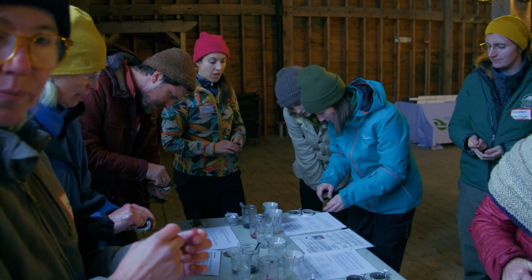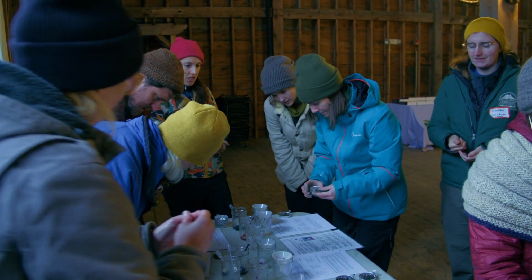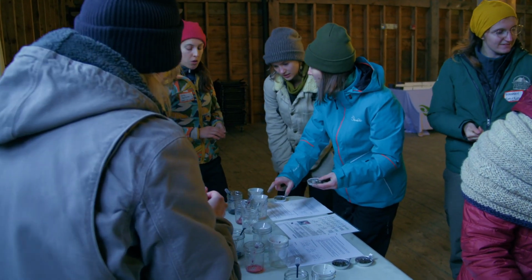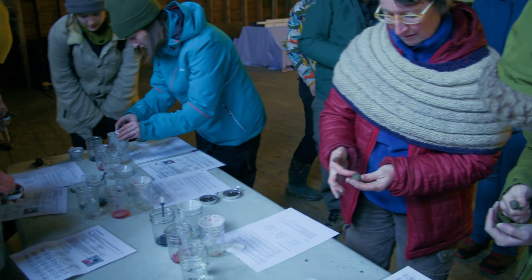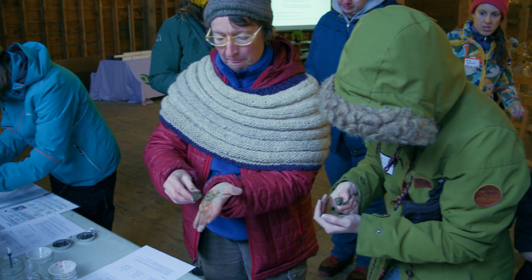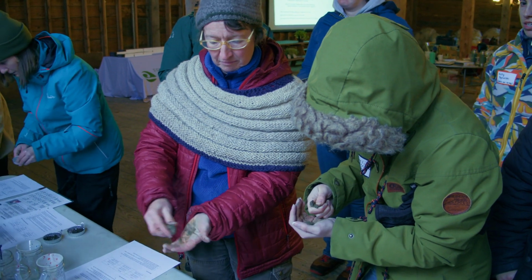Perfect. This is the exact amount. We're going to put the whole thing in, dumping the whole thing in a little pile above the cotton. Yep, above the cotton is great. That is totally good.